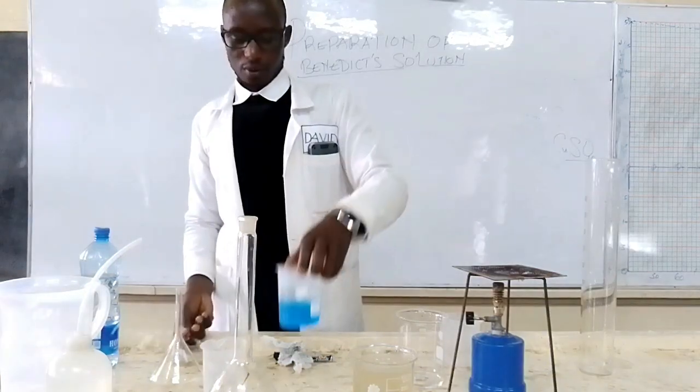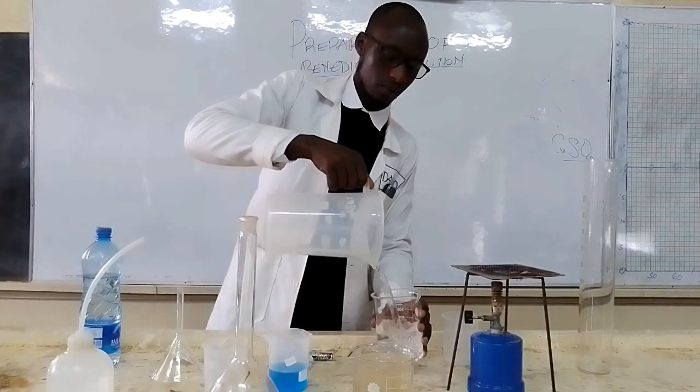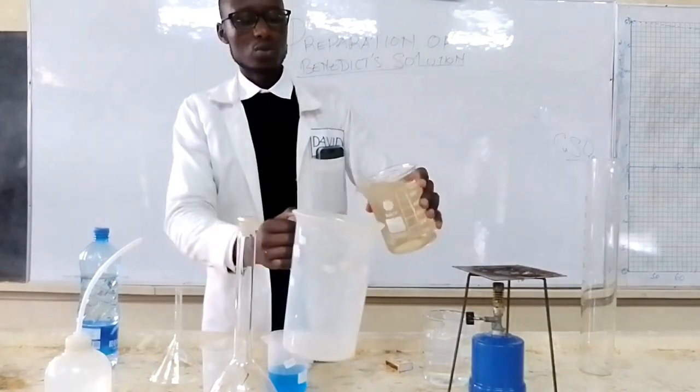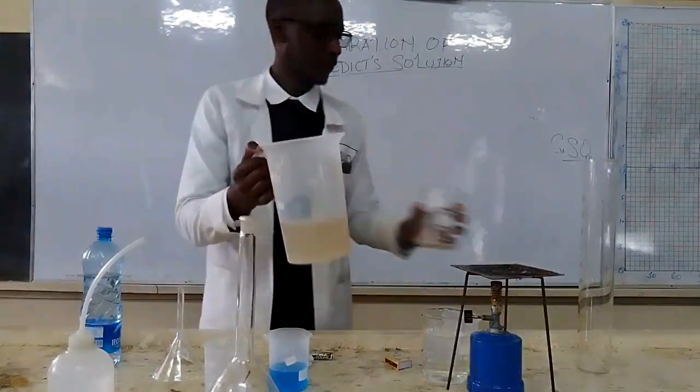So my copper 2 sulfate solution has dissolved. This is distilled water. So I can transfer this one to a better jug that I am using.